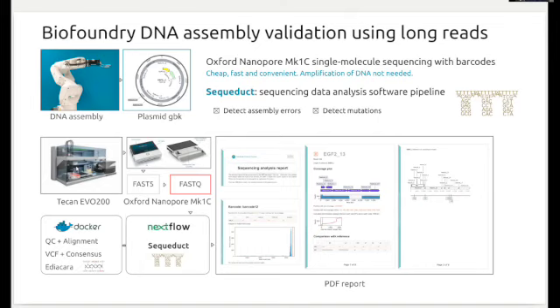Just a quick example here. You can see the size of the reads on the histogram. It can provide various flags, show you the variant code, the mutation table, show you the annotations of the mutations that have been detected, or it can show you as well the coverage of the DNA of the reference sequences. So you can see whether a misassembly or a misannealing of the part happened, something has been skipped. You can compare the length of the reads with the expected sequence and so on.